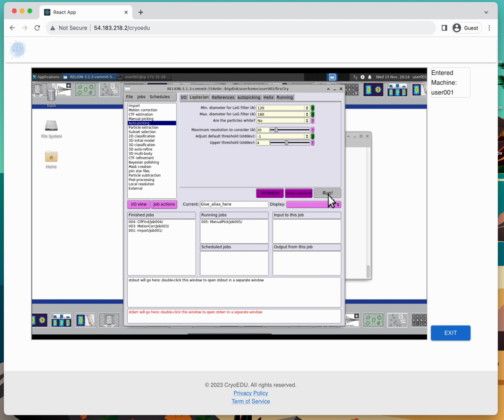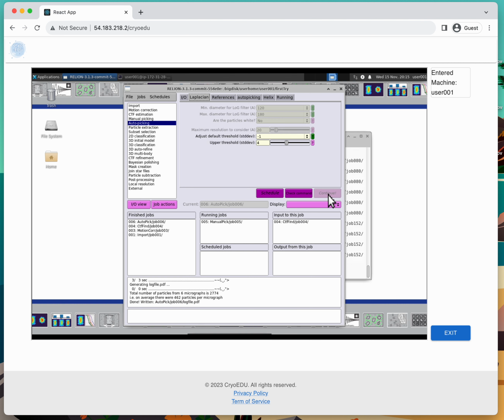This job is going to be picking particles using diameters as the choice. And this will show you that it's possible to pick particles this way, again without a reference in mind, just with diameters. You'll also see that it's not as good as other particle picking that uses references, because it doesn't know what it's looking for. It's just using rough diameter and shapes. So as the end user here, you want to try and optimize the picking to be the quote best it can be, meaning the least number of false positives, and we'll look at those in a second, and picking most of the real particles, so the least false negatives possible.